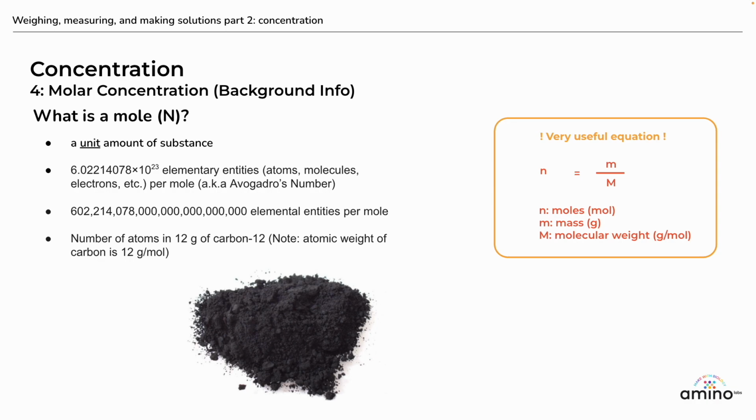You might have seen it around in various places. And so hopefully we can bring that together and make it of use to you in a lab, because molar concentrations, I would say, are probably the most widely used concentration type used in labs.